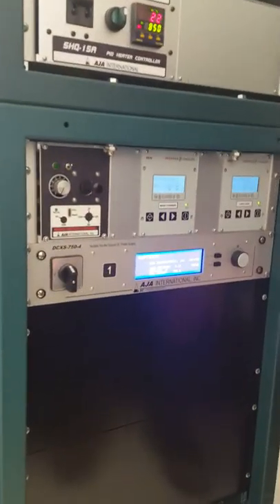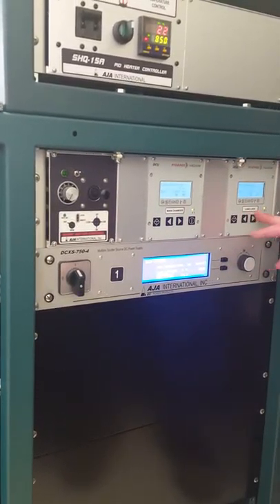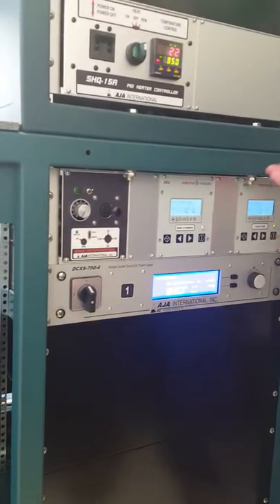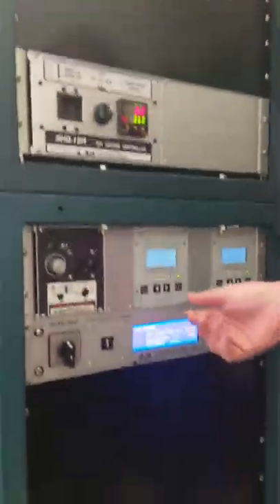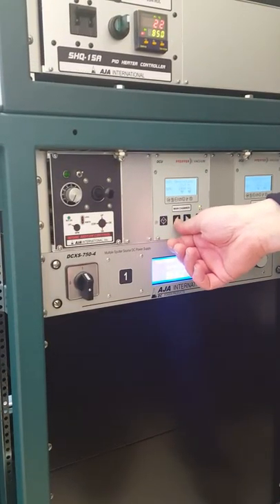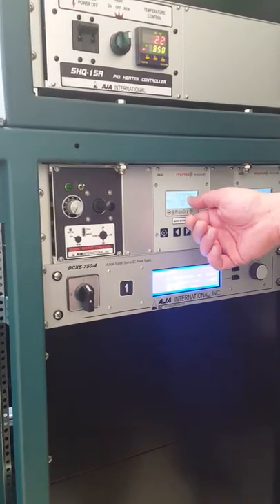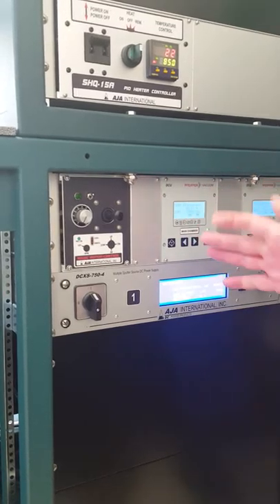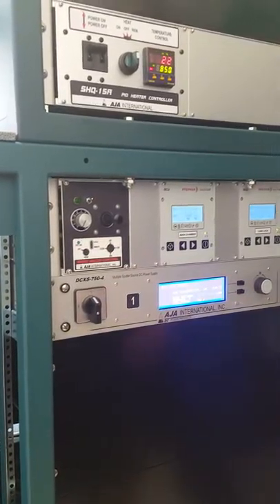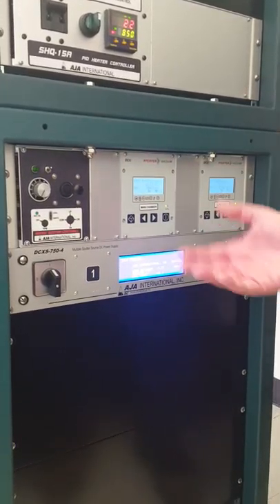This is the pump controller for the main chamber and the controller for the load lock turbos. There's not much you need to do with them — they kind of just do their own thing in the background and you're really controlling them through the breaker switch. Sometimes I'll look in here to check the drive currents. This current reading is a good baseline indicator for the condition of the chamber — if there's a lot of outgassing or a leak, the gas load on the turbo will drive that current higher.